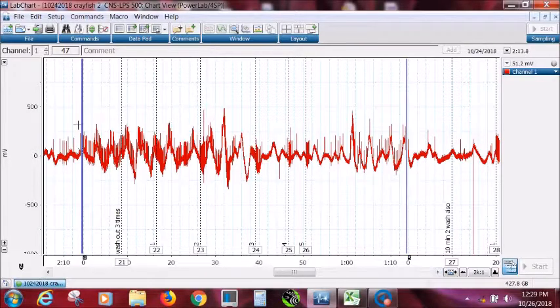And then we washed it out, changed the saline bath, and usually change the saline 3 times in the dish to try to get all the LPS out. So this is why it says 3 times. Sometimes we don't write the 3 times, but we changed it out 3 times. And now we're brushing again on the side of the animal. So here's 1, 2, 3, 4, 5. And look, it's not as active the 5th time than it was the first time.